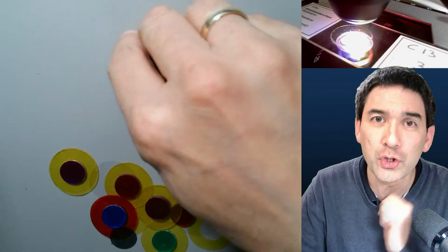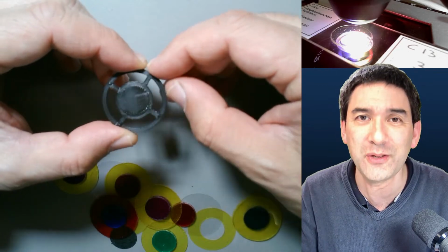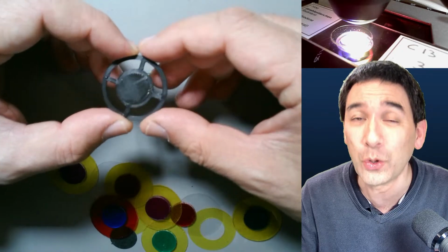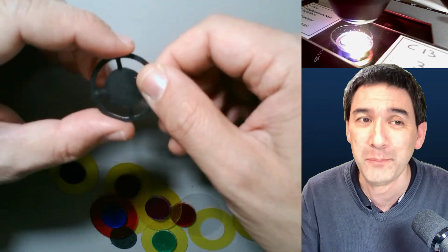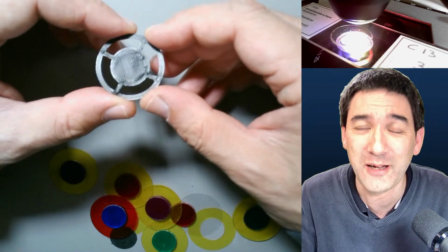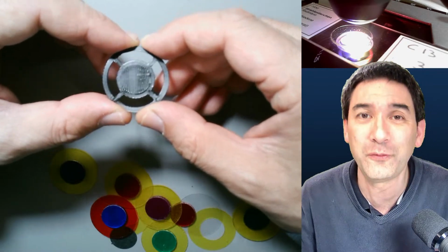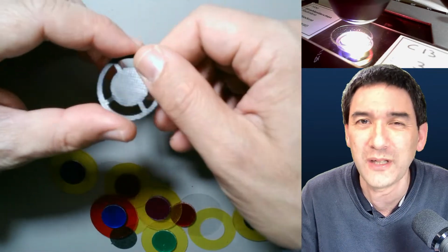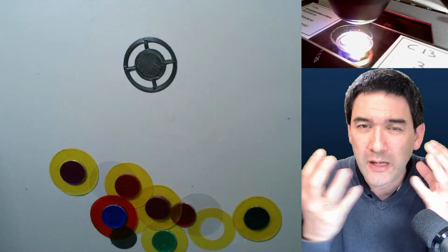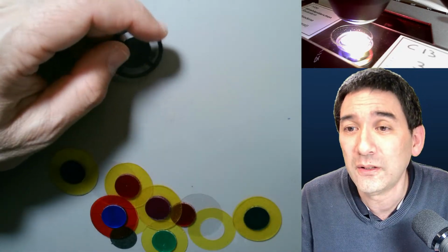However, I'm not sure if those comparatively low-cost dark field condensers that you can buy actually do contain this concave mirror, or whether they also have a built-in disc. I don't know about that. That's something one has to look at specifically. I know there are some dark field condensers, but one has to check: do they just contain a normal disc, or do they really contain a concave mirror system, which must be quite expensive to manufacture? So let's go down here again.